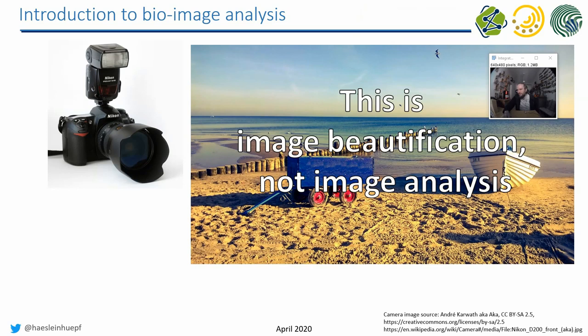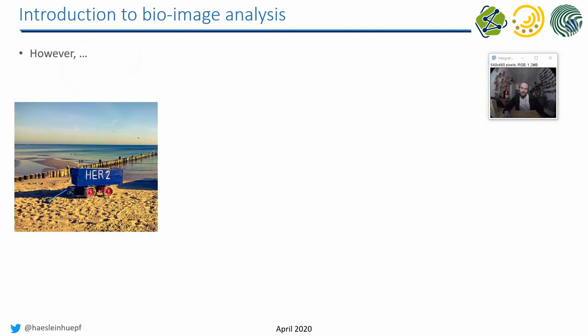Sometimes we do things like that for better visualization, for example, when you want to make a figure ready for publication. Then you do things like that to increase the contrast, to show an object in a better way. But it's actually not so popular and not so scientifically correct to do these kind of operations in a scientific image analysis workflow. Nevertheless, sometimes we actually have to do things like this.